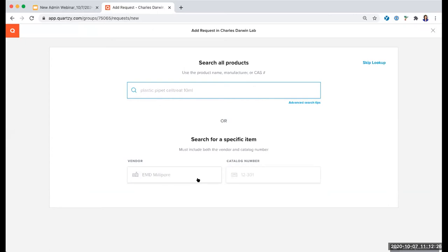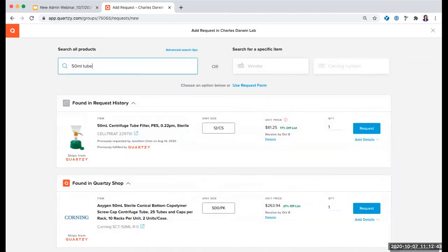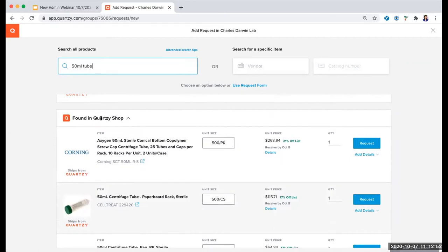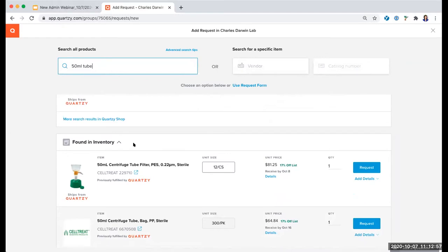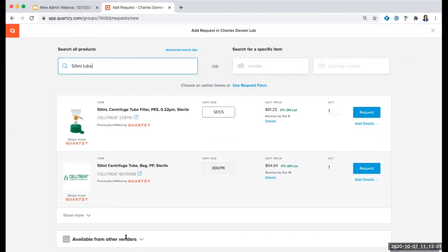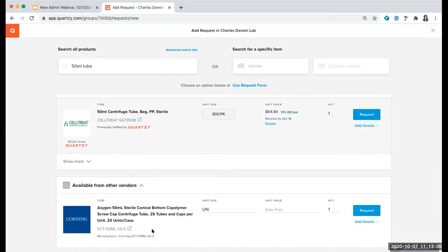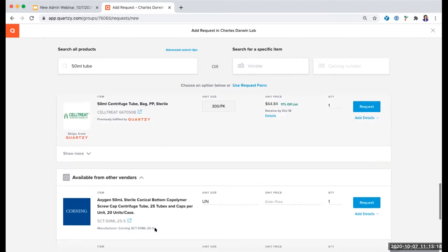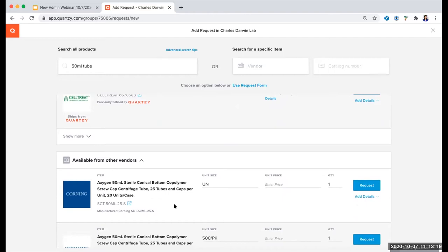Members may have the exact vendor and catalog number ready if they know what they need, or they can enter any keyword or phrase — like, for example, a 50 ml tube — to search and see the following options: results under previous requests, options to purchase through the Quartsy shop, items from the inventory module, and options from other outside vendors. A question came in: can you change information after being ordered, received, or inventoried? Yes, there is absolutely the ability to edit item details after items have been requested or added to the inventory. I should be able to get to that once we have a new request.